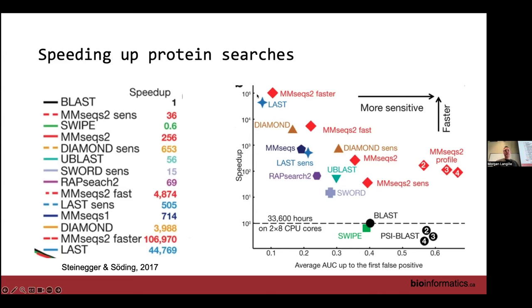Yeah. So, I think it's good to get to the pathways and describe it. I think it's cool if you want to go back and try to map it to the individual genes, because it gives you an idea, to me anyway, of whether it really is that pathway that's really different. You see a whole bunch of genes differently abundant between two groups, and you're like, oh, that does look really cool. But if it's only one gene, maybe it's a bit misleading. Maybe it's not that pathway at all. Maybe MinPath did a poor job. And you could be misled before you start going into your big experiments, so you might want to dive into it as much as possible so you're not misled by that.